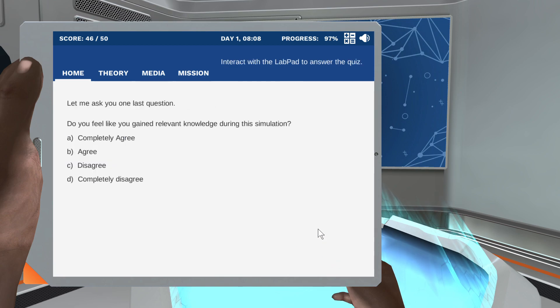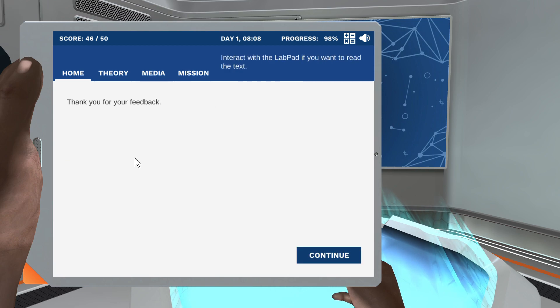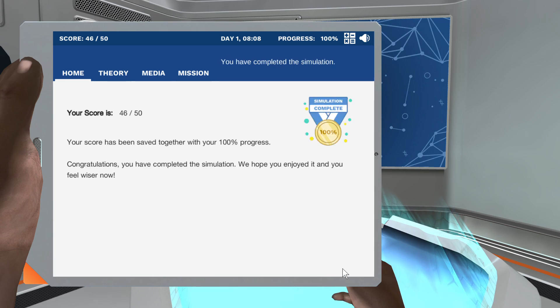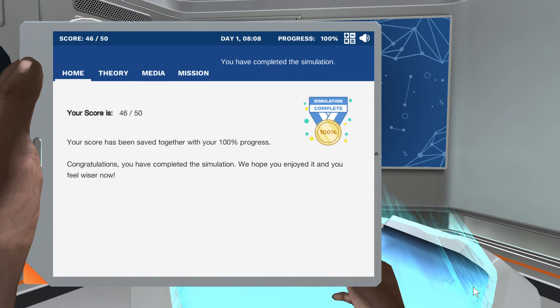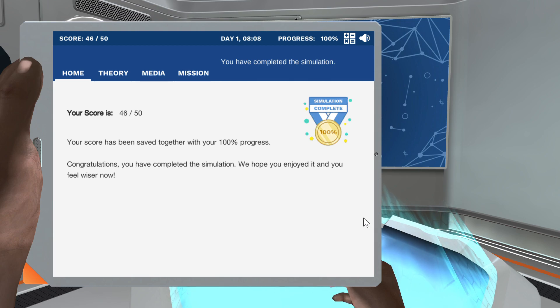Thank you for your feedback — your score has been saved together with your 100% progress. Congratulations, you have completed the simulation! We hope you enjoyed it and you feel wiser now.